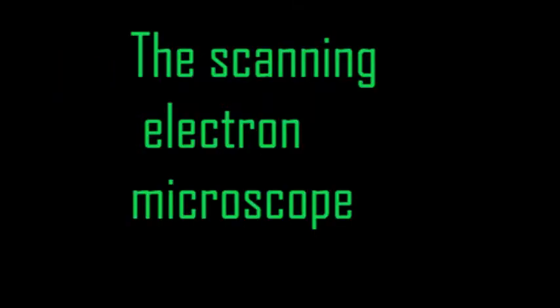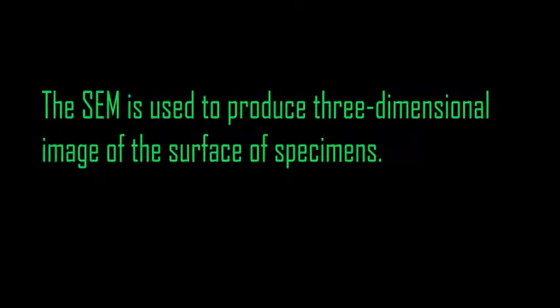Second, let's describe the scanning electron microscope, SEM. The scanning electron microscope is used to produce a three-dimensional image, 3D, of the surface of the specimen.